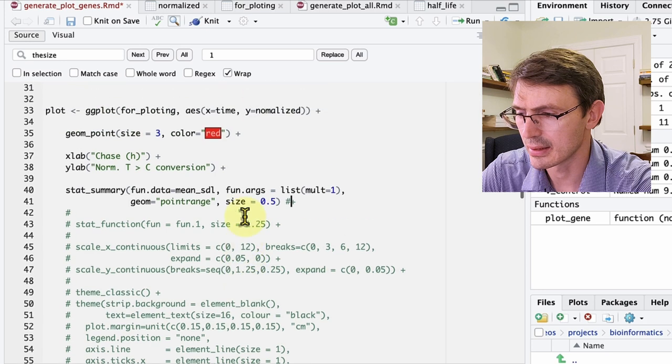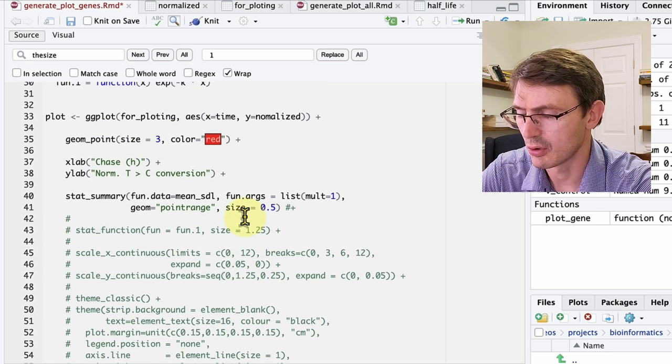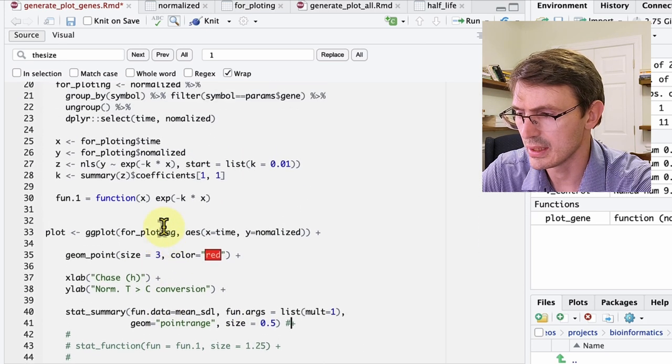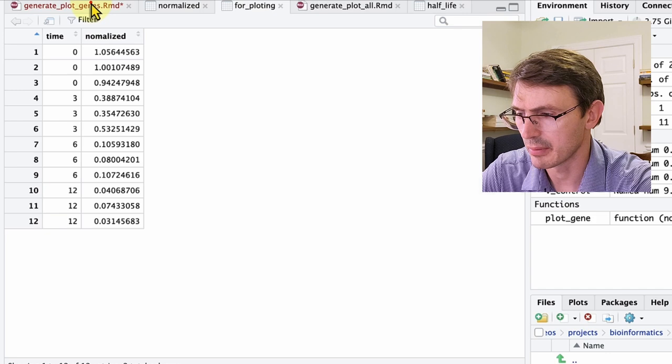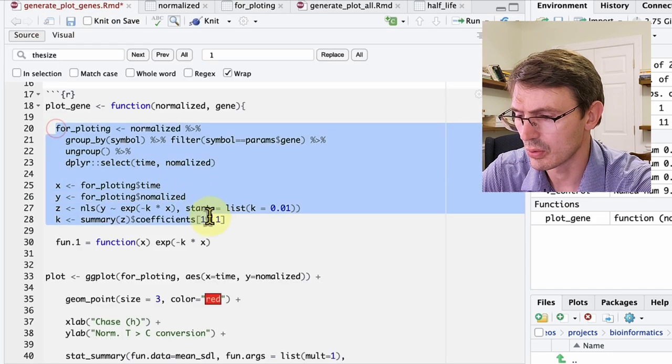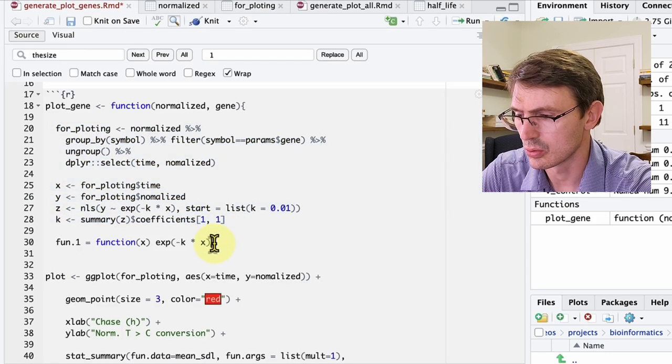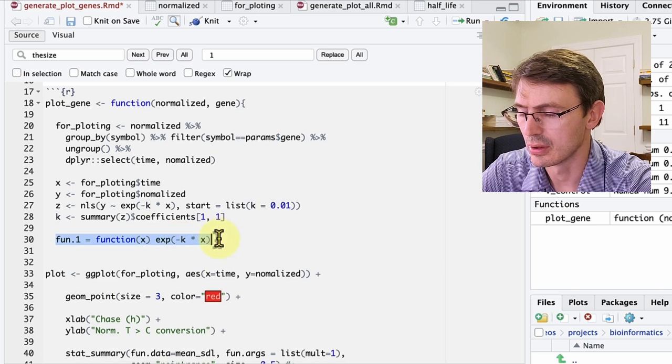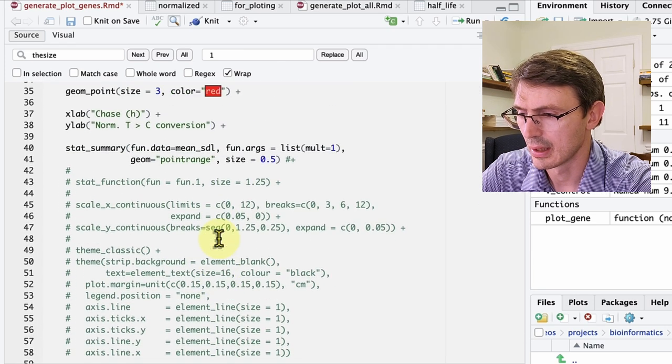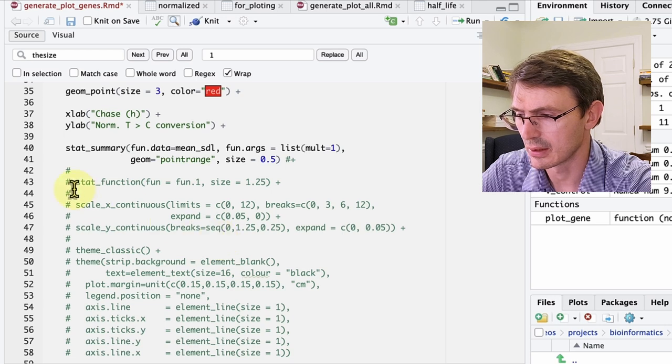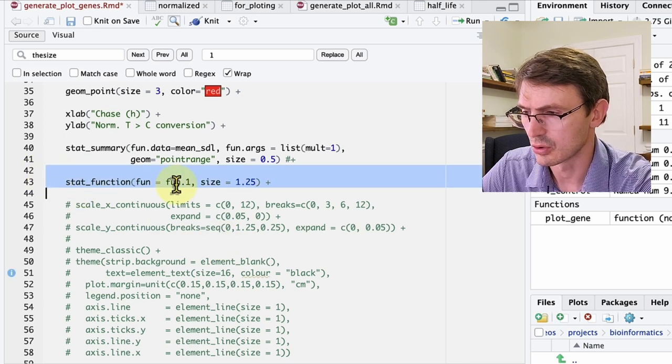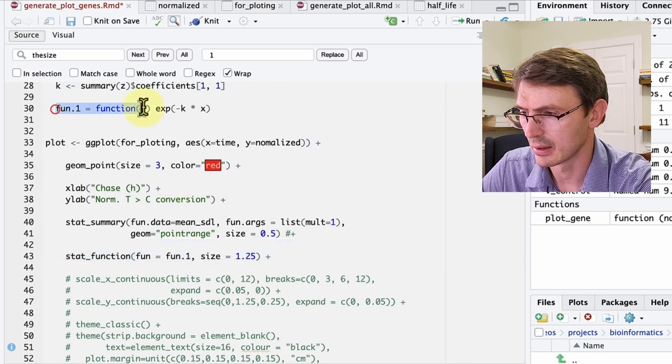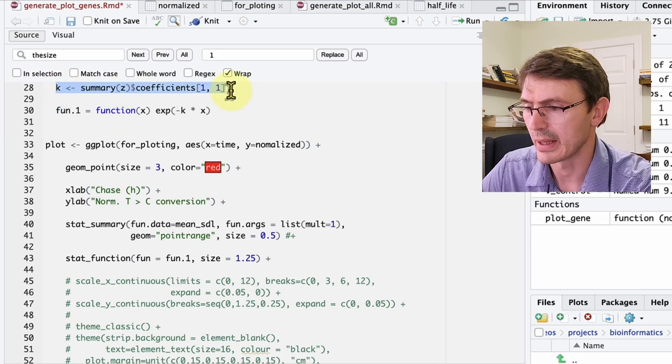Now we can add some extra information. So with this table for plotting that we have here, in this section, what we are doing is calculate this k value again, so that we can plot this function in our graph. And we do this with this stat function. And we pass this function one that we define here by calculating this k value.